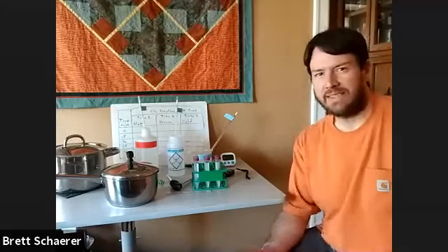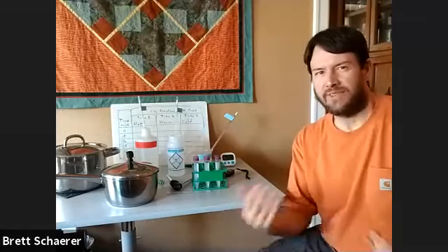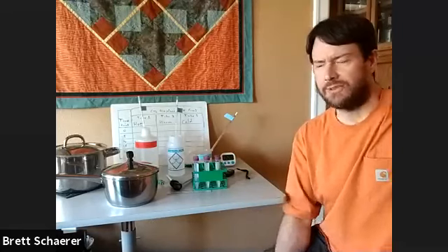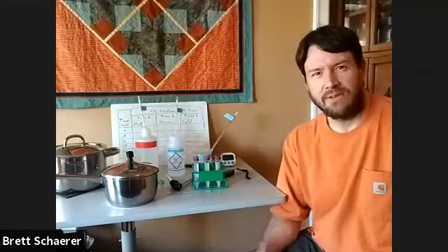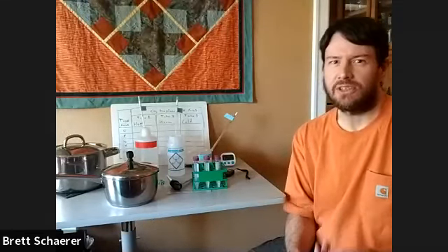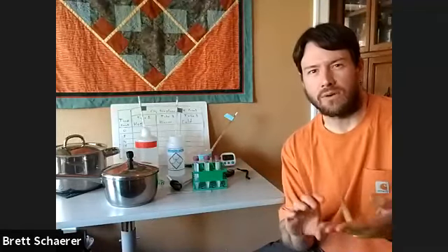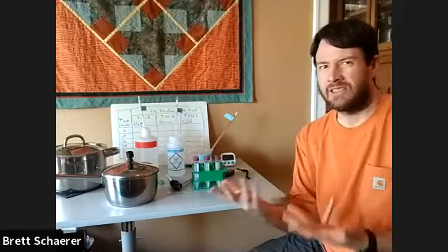So this one is the student-designed investigation, and usually we have a lot of different options for different independent variables to choose to see how that affects fermentation rate. I'm not going to do all of those. It could be things like temperature, or the type of sugar solution, or salt solution, or salt concentration.